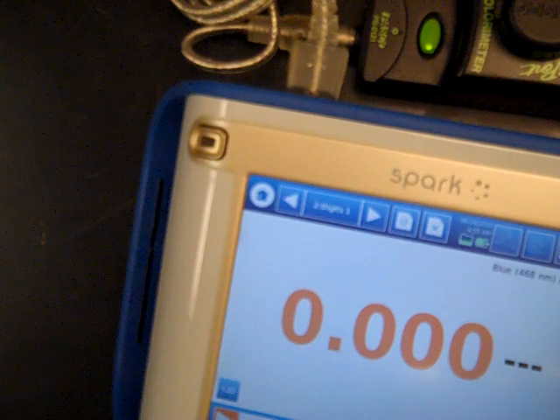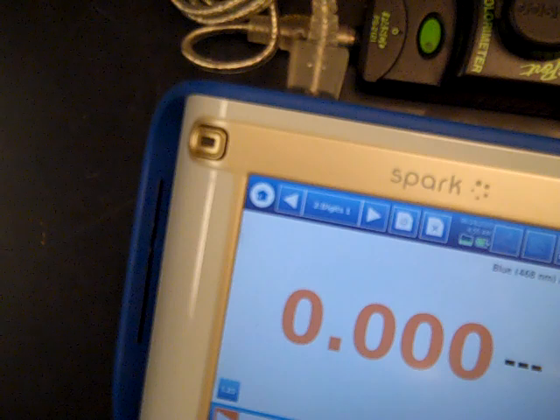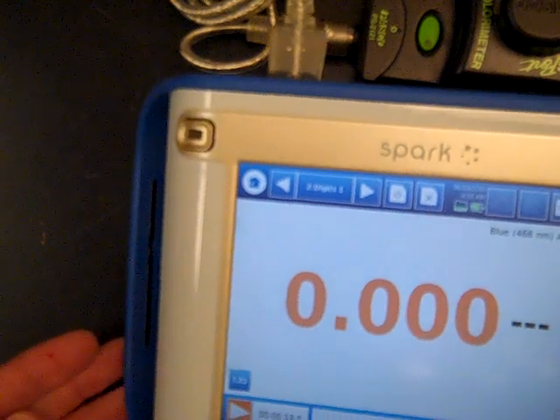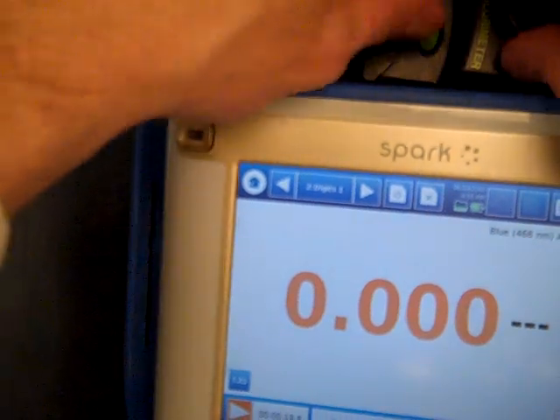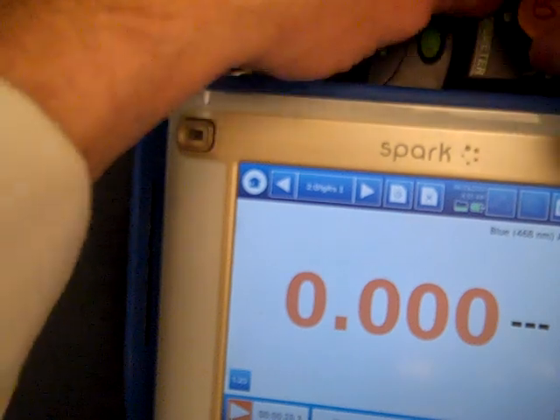Once the green light goes off, the blank has run, and we have a 0.000 absorbance.